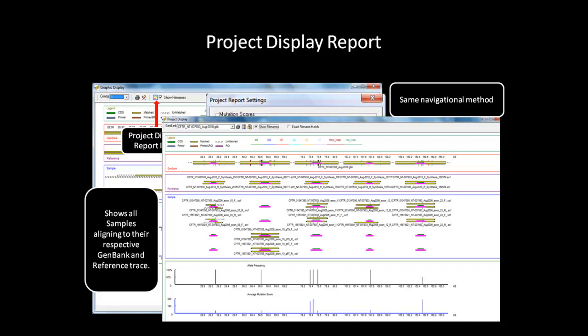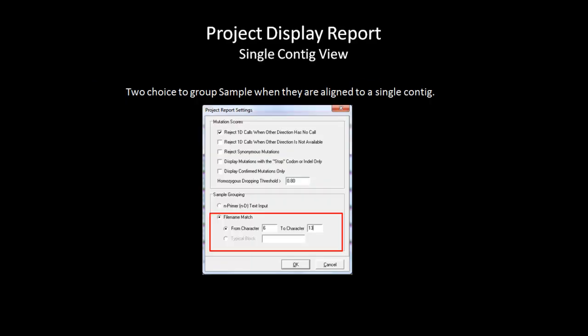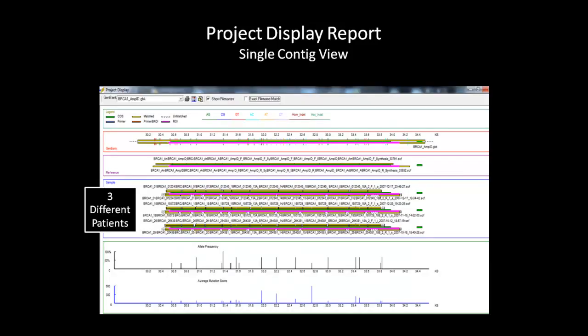Next, we will talk about the different grouping options in the project display report and how it can give you a different graphical view of the samples in your project. The file name match will group the sample files by specific characters, resembling the grouping tool in the project reviewer. Select OK and the project display report will generate. In this window, the project display report automatically groups all samples into three specific IDs as specified. This view shows samples from three different patients aligning to a single contig. As you can see, the sample pane shows where on the contig each sample file aligns for three separate patients. You can print this report by using the print icon located in the toolbar.